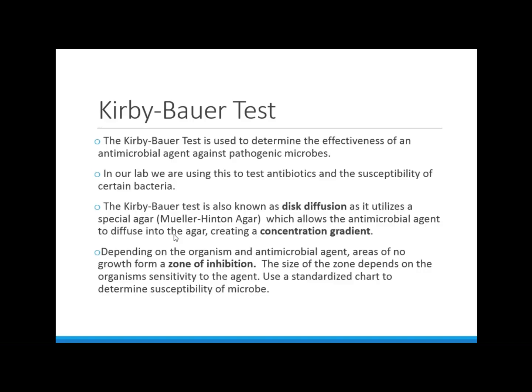Okay, so you need to watch a video. I'm going to walk you through it, but you also need to watch a video. Imagine if you were doing that in lab, and then what I've done is I've given you the results. Okay, so let's talk a little bit about this assay. It's known as the Kirby Bauer test. It's also known as a diffusion test.